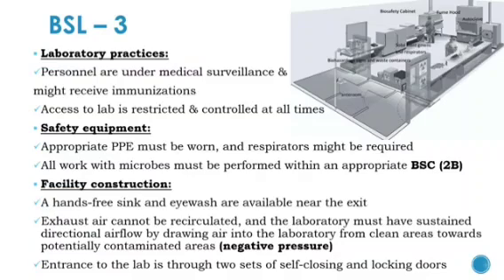Facility construction. A hands-free sink and an eye wash station must be available near the exit. The exhaust air must not be recirculated within the lab and must be released to the outside after passing through a HEPA filter.